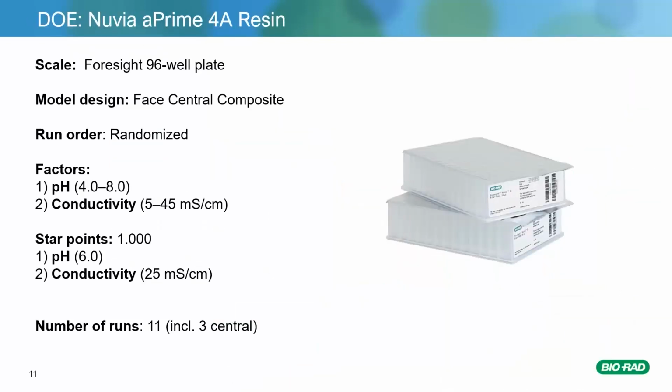We used for that purpose a DOE design called Face Centered Central Composite with a total number of 11 runs, including 3 center points. The study was done on Foresight 96-well plates filled with 20 microliters of Nuvia aPrime resin. Factors tested were pH and conductivity, with pH in the range between 4 and 8 and conductivity in the range between 5 and 45 millisiemens per centimeter.